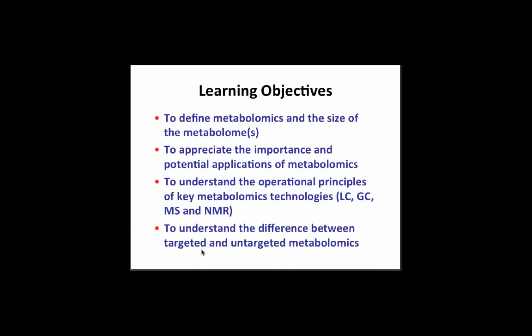So this one is really an introduction to metabolomics. Many of you are actually already doing metabolomics, but a few of you are fairly new to the field, and so this is sort of a get-acquainted lecture. We're going to talk about some of the applications of metabolomics, or potential applications, many of them already mentioned by people. And we'll also talk about the technologies, the major platforms, primarily chromatography, liquid chromatography, gas chromatography, mass spectrometry, and NMR.